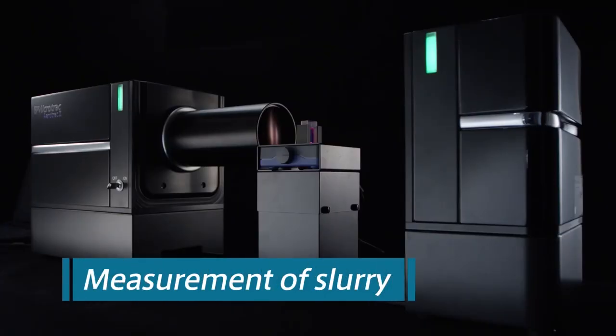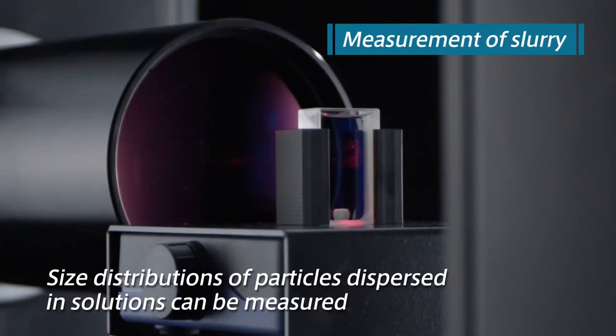Measurement of slurry. Size distributions of particles dispersed in solutions can be measured using dedicated silica glass batch cells.